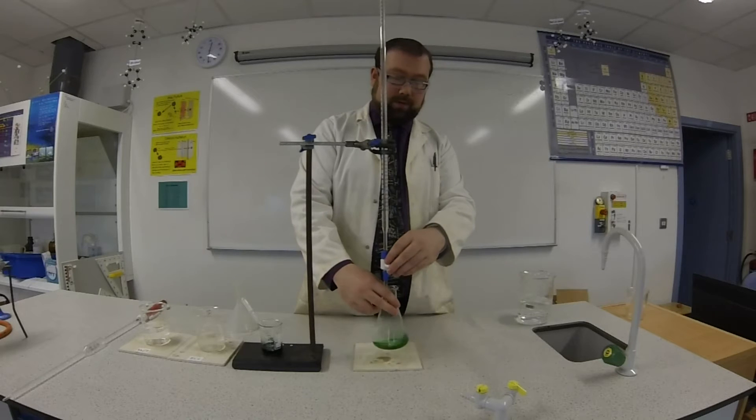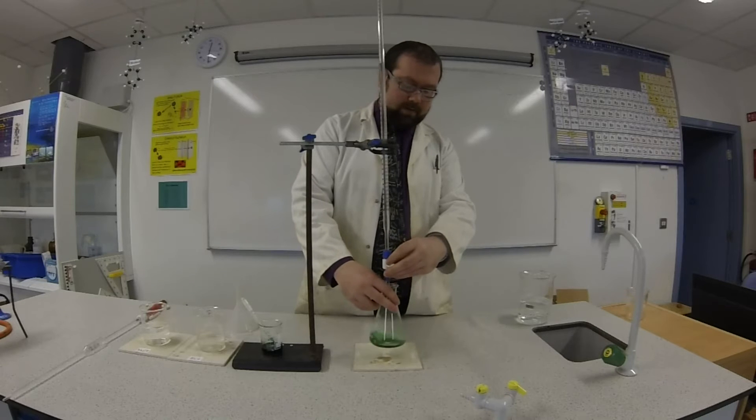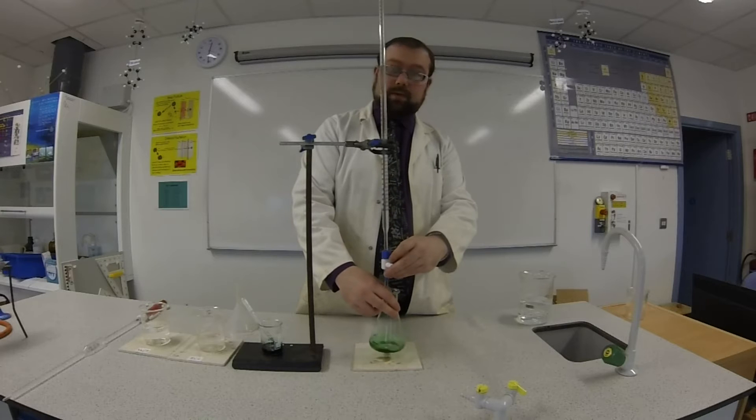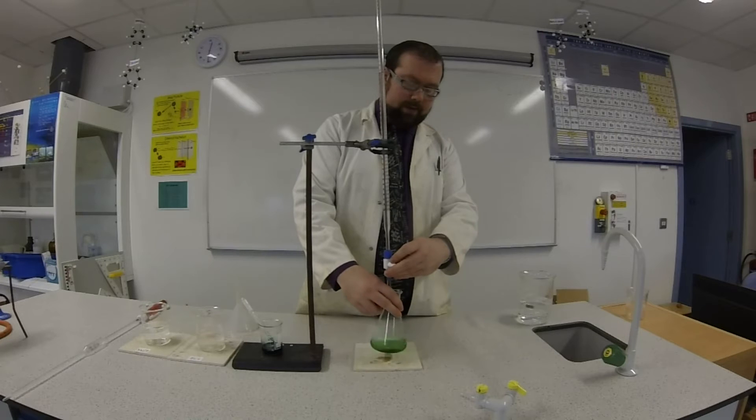So currently just free flowing. I'm looking for that red colour change. Just little spots of red appearing now so I'm slowing down the flow a little bit — give it in a bit more at a time. Make sure you keep swirling it. It may look like it's starting to go red but once you mix it up it will go back to green because it's still slightly basic.